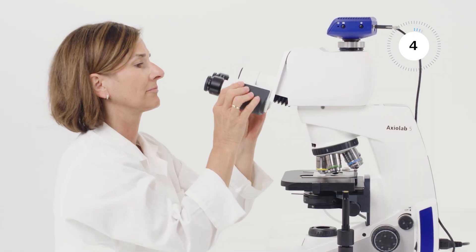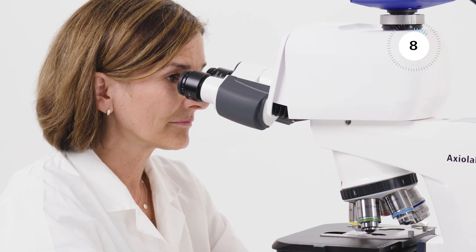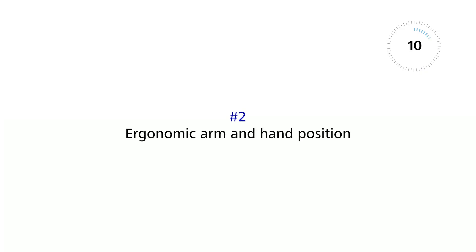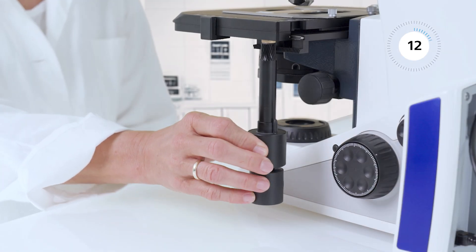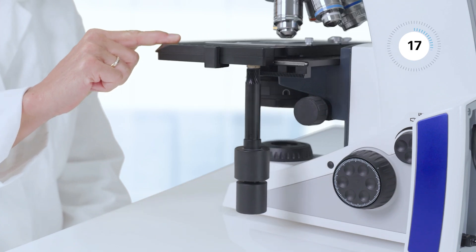Adjust the angle of the tube for a rather straight view into the eyepieces, maintaining an upright posture. Adjust the height of the stage drive to let your hands rest comfortably on the table. Fine-tune the stage for smoother movements with minimal force.